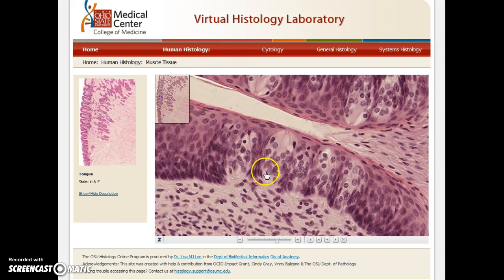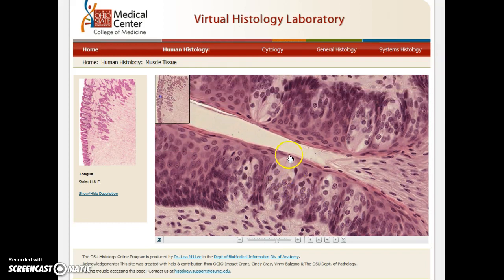So they're almost oval or grape shaped, and there would be a little hole right here and right here. The food has to dissolve and be able to come down into this groove between the papillae, so they have access to this taste bud, and that's what allows you to be able to taste.